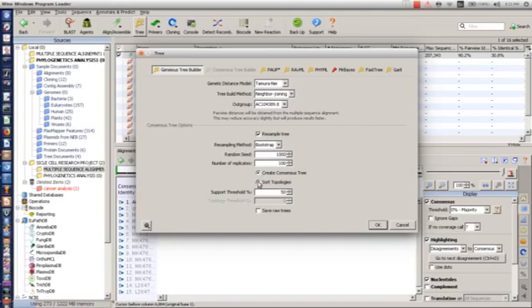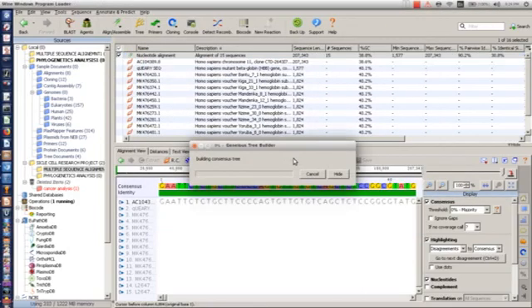So you can use any of these and leave it at maybe 50 or so, but always try to use create consensus tree, because if we're talking about consensus, we're talking about similarity. What we're working on is similarity. So you click OK, and it's going to run.